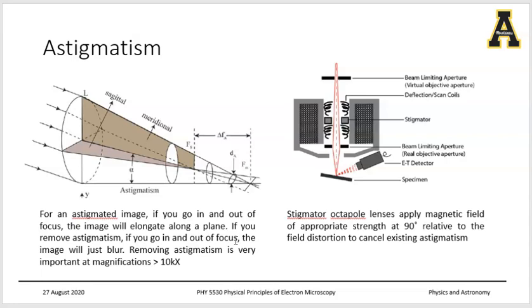as a result of which you have the astigmatism. So how you can counter this is by using the stigmator coils, which is basically an assortment of 8 different coils that apply tiny magnetic fields to distort or to deflect the electron beam in such a way that you minimize the delta FA, right? You minimize it, and that way you're able to get rid of astigmatism, right?